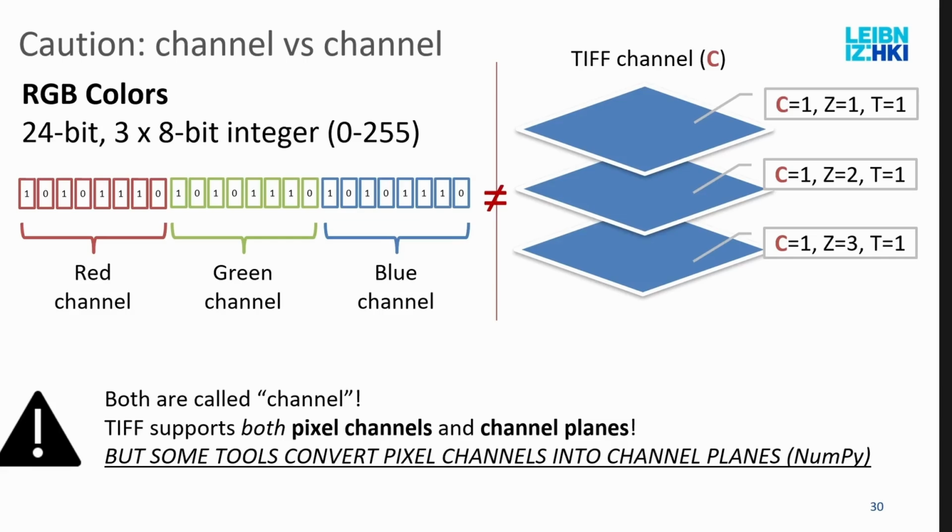So you have to be careful. When you have a 12-bit image that has 3 channels, it is very likely that per pixel you have a 12-bit integer, just one value, but then you have 3 different channel locations. So we have a channel 1 slice, channel 2 slice, channel 3 slice in there, and whatever else in the stack. So in a simple 2D plus channel image with 12-bit, each one is 12-bit, 12-bit, 12-bit, organized like that, so the image tool can access it like that.